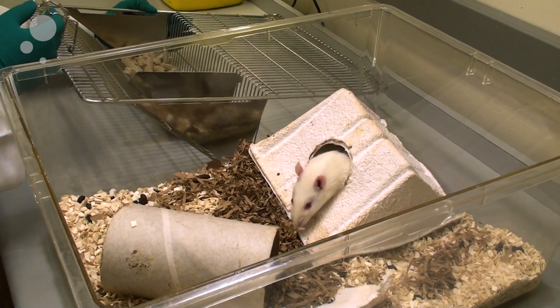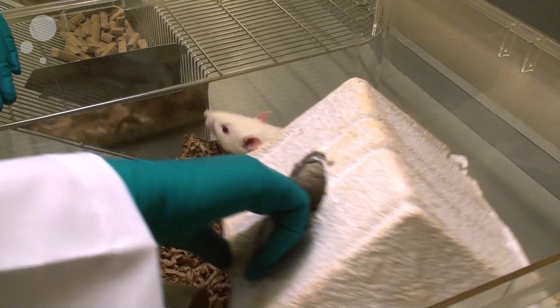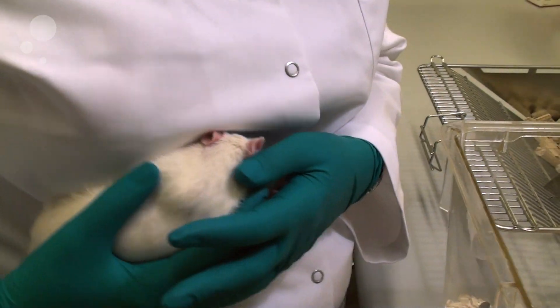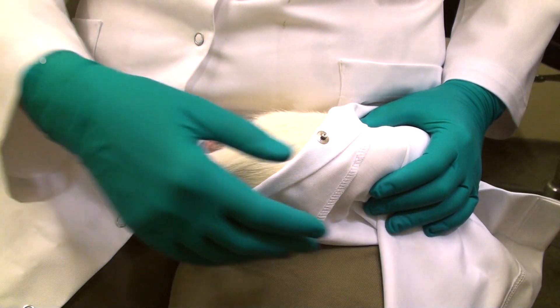If you're going to inject a rat subcutaneously and he's a little anxious, there is a way of doing that that will give him a little more calmness around the procedure. You can pick him up and simply wrap him in your lab coat, making a slight cone in which he can hide his head.